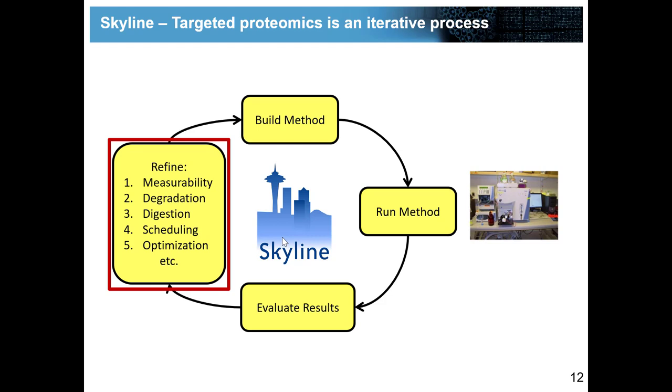Refining means you for example throw out peptides that you thought were detectable but are not, or they're degrading or not digested efficiently, or you first do a non-scheduled measurement and then start doing scheduling, or you optimize any other type of parameter like collision energy or declustering potential. Once you refine your parameters you will build a new method which you will run again, evaluate, and this cycle can happen a few times before you have a final method. The cool thing is that Skyline is exactly built to support you in all these steps.